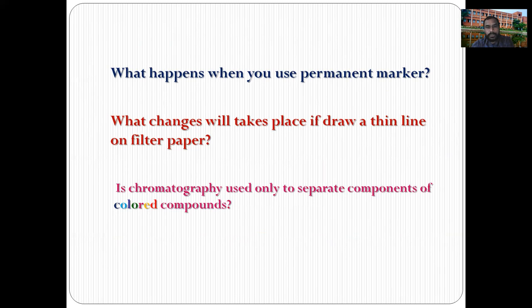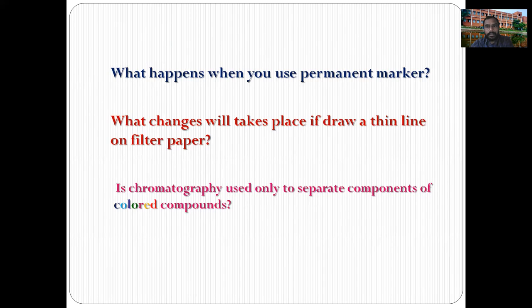What happens when you use a permanent marker instead of a non-permanent marker? With a permanent marker, the ink components are strongly adsorbed onto the filter paper, so they do not rise along with the solvent, making separation difficult. What changes occur if you draw a thin line on the filter paper? If the line is very broad, less separation is observed; if the line is fine and thin, better separation of color pigments is observed.